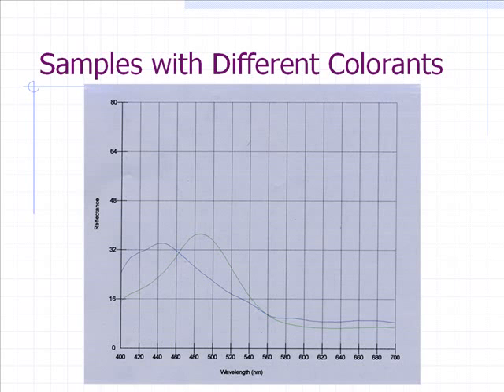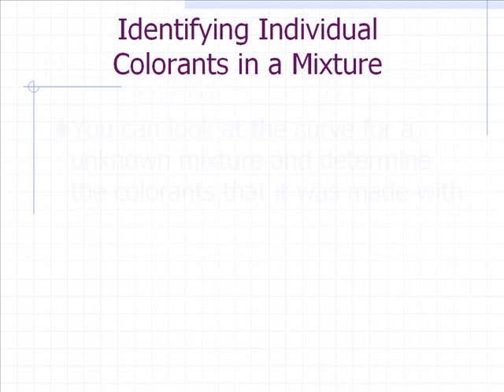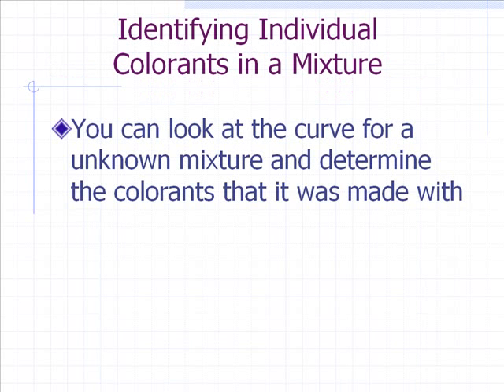One of the biggest uses of curves, and what we'll do an example of here, is that you can look at a curve for an unknown mixture and determine the colorants it was made with by the shape of that particular curve. There are specific parts of the individual curves that carry over into the mixture. So you look at certain parts of the curve that are important for taking the individual curves into the mixture.